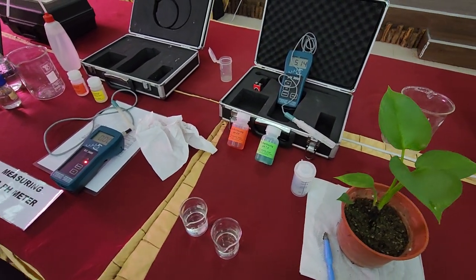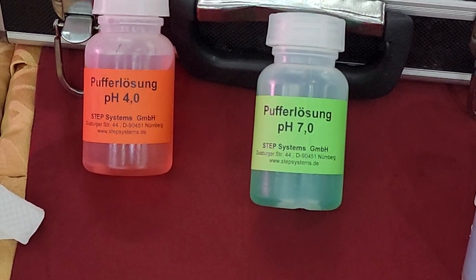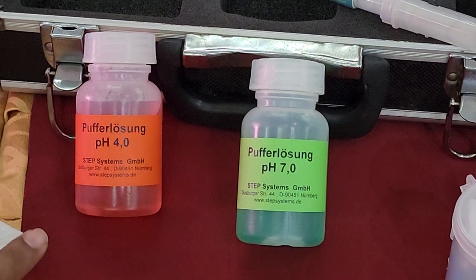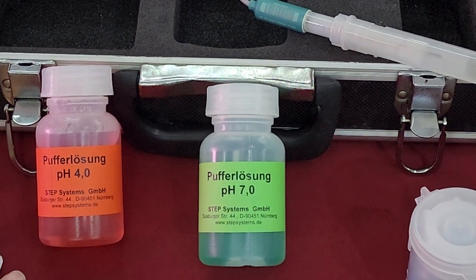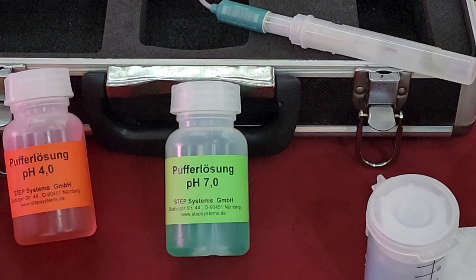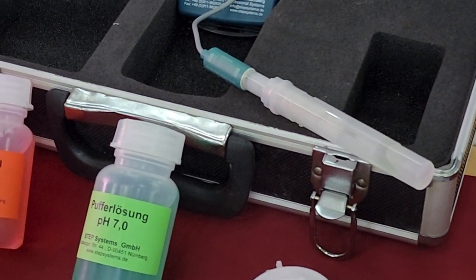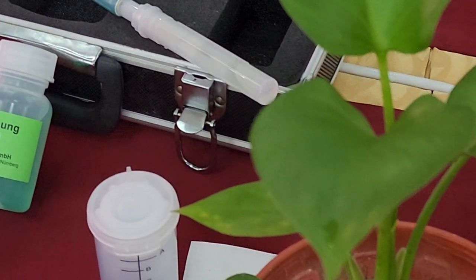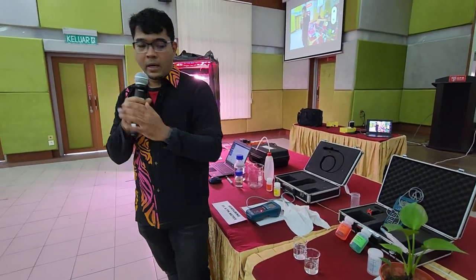I forgot to mention earlier, both EC and pH, before you use, at least regularly, you need to do the calibration. I've done the calibration yesterday. So you see there is a buffer solution here. This buffer solution means that the pH of it is known. It was created by the factory. They know the amount of hydrogen present in each of these solutions. So when we dip the measuring probe, we can calibrate that machine. Now you are in the solution of 4. I know that you are reading 3.9. Correct that to 4.0. That's why calibration is important. Okay, so that has been done.